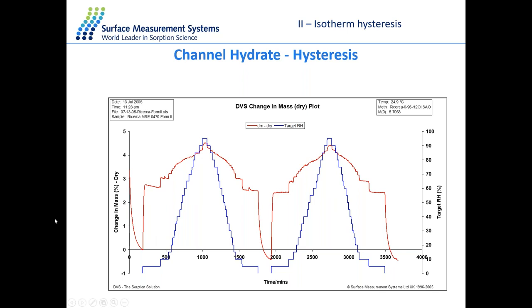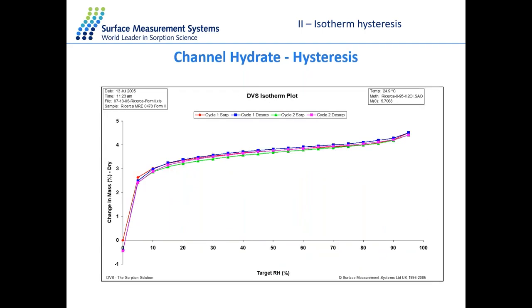Once it's saturated, then it has almost only surface absorption. So if I look at the isotherm plot of these data, you can see it has a very different shape from the one that I was showing you before. It doesn't have a massive gap of hysteresis because the hydrate allows the formation almost immediately, because it's attracting water into the pore itself almost immediately.